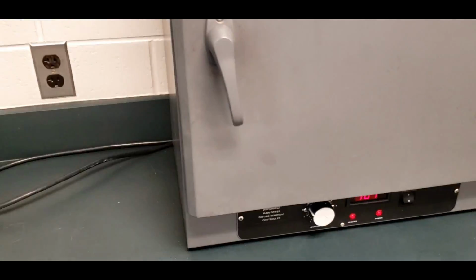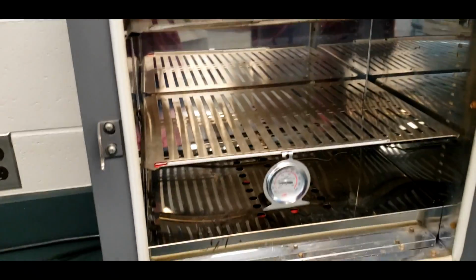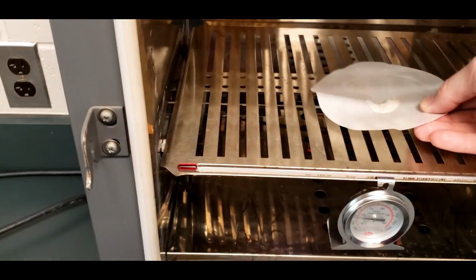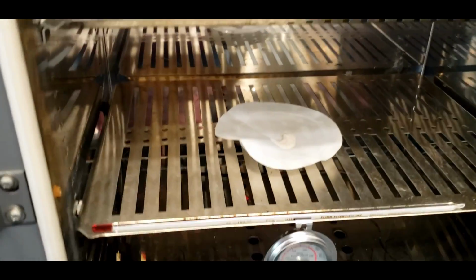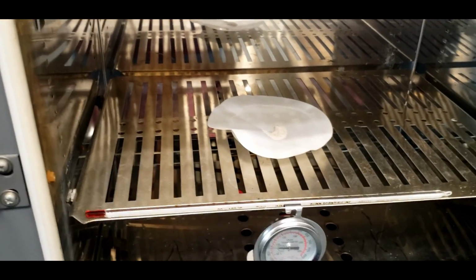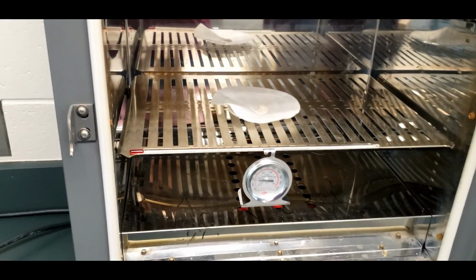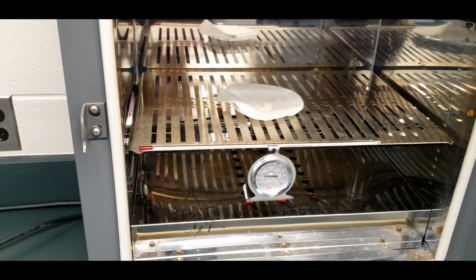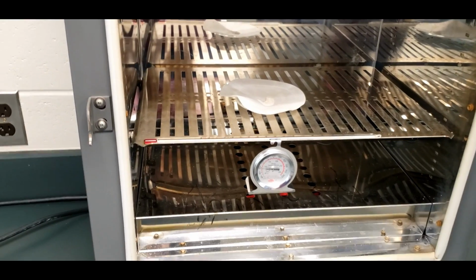And here's the oven. Open this up. Got a few levels here, and here's the sample. Put that right in the center. Normally you'd put your initials on it in pencil before it got wet so you'd know whose is whose, but I think I'm pretty safe since there's no one else even on campus. All right, and then we'll let this sit in here for, I think it was 20 minutes, but I'll just let it go until I'm sure that it's dry.